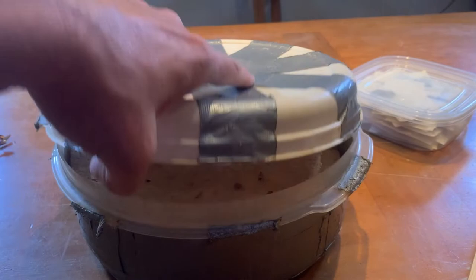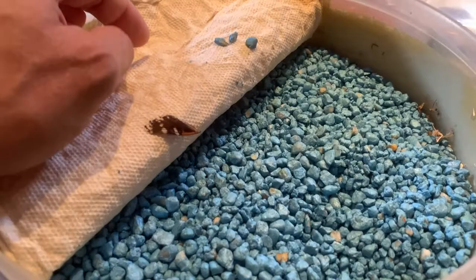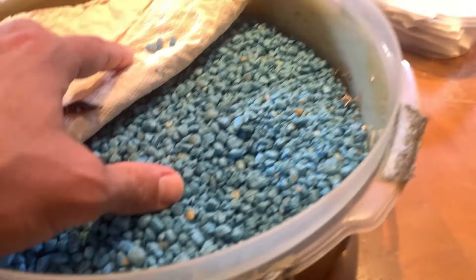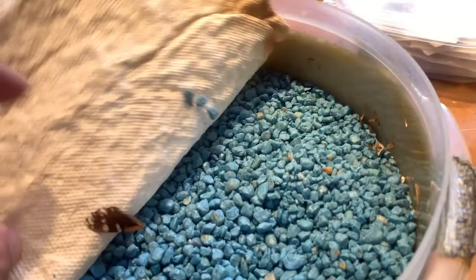Now we're going to show you the insides of a rehydration chamber. The first thing we're going to do is put some kind of substrate — this is literally fish gravel. You can use sand, you can use whatever. This is a porous substrate, and I've got about an inch and a half or two inches thick of the substrate inside of here. This is where you put your water.